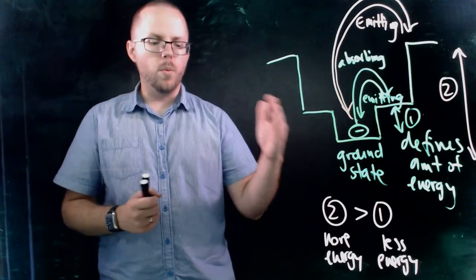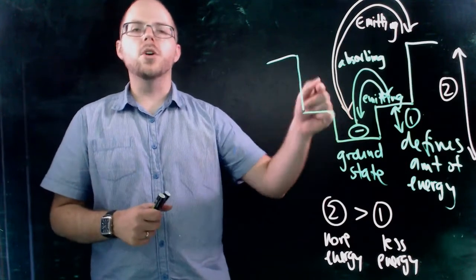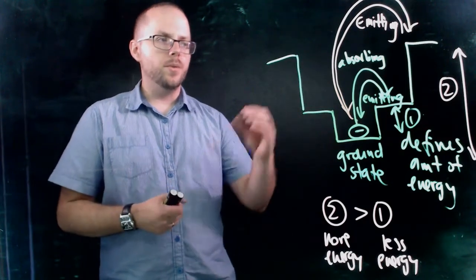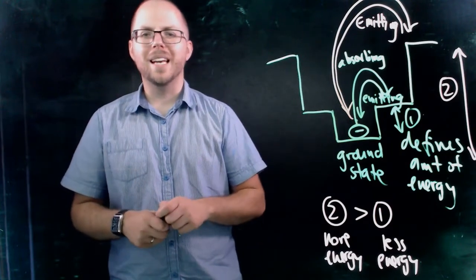Okay, and so what we can do as scientists, in recognising this phenomenon, is say, right, let's document what colours or wavelengths of light given atoms will produce. And so we've documented it, and then we can use that information to look for those particular elements.